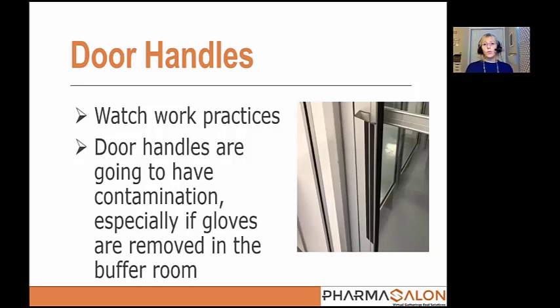My question to you would then be, does that matter? Does it really matter if you have microorganisms on the door handle in the ante-room? Especially because anybody re-entering there that maybe has gloves on, before they go back in to start compounding again, they're going to be donning new gloves. So again, take a look at how that might impact the space.